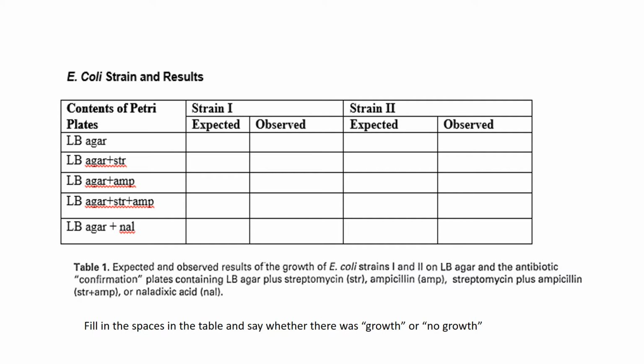For the observe category, you will need to pause the video and observe each plate to determine where there was growth.